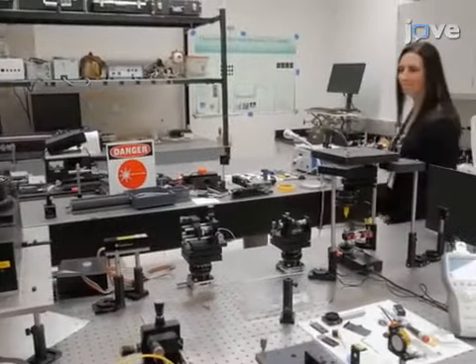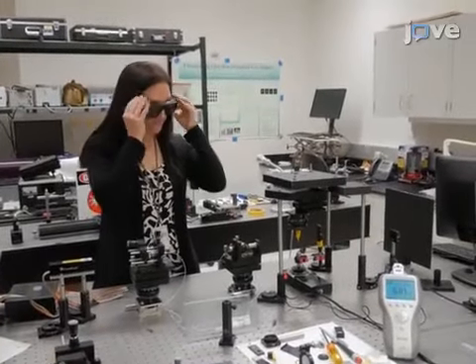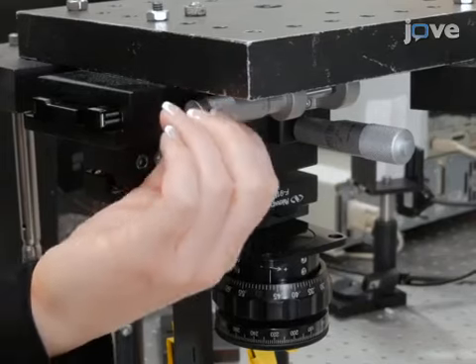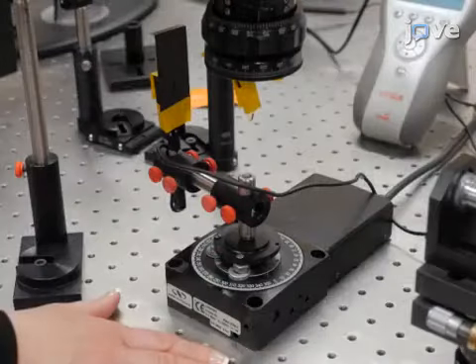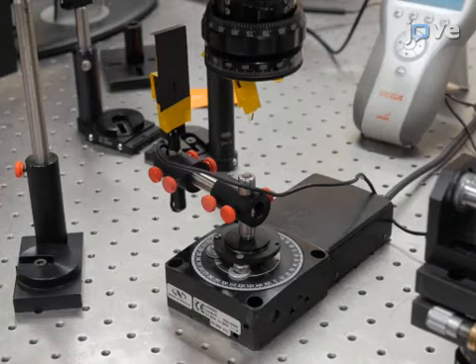The experimental setup is assembled on a benchtop. At its core is a Goniophotometer designed around this programmable 360-degree rotation and linear translation stage. The stage rests on a platform that enables translation and tilt adjustments.